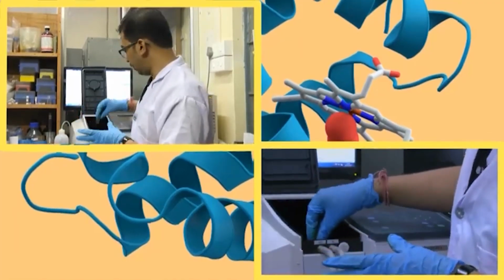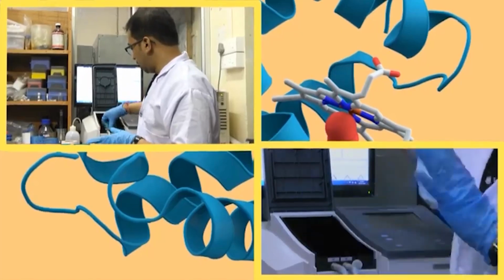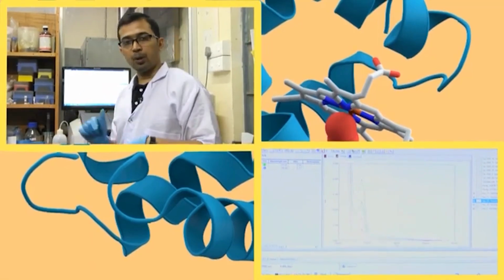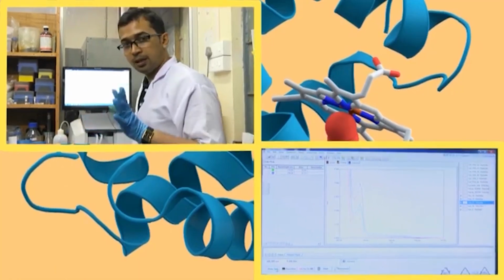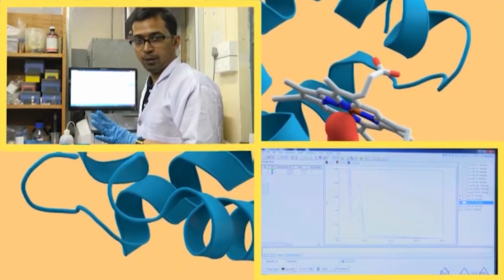Initially you take 3 ml solution and gradually add 5 microliter of HSA. The first concentration of HSA should be calculated in a volume not of 3000 microliter but 3005 microliter, the final volume.